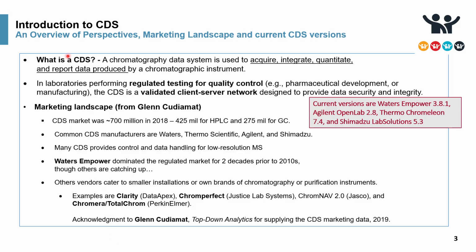Here's an introduction to CDS. First, what is CDS? CDS stands for Chromatography Data System and is used to acquire, integrate, quantitate, and report data produced by a chromatographic system, such as HPLC, GC, or IC. For laboratory performing regulated testing for QC, for quality control, in both pharmaceutical development or manufacturing, the CDS is typically a validated client-server networking system designed to provide data security and integrity.